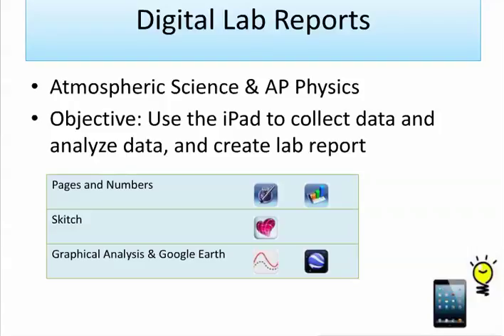It has a curriculum that's prescribed by the College Board, so we're able to do a lot of really great lab activities. Students will collect and analyze laboratory data using their iPad. We use the Vernier LabQuest 2. We use a lot of sensors. And then there's an app we use called Vernier Graphical Analysis.